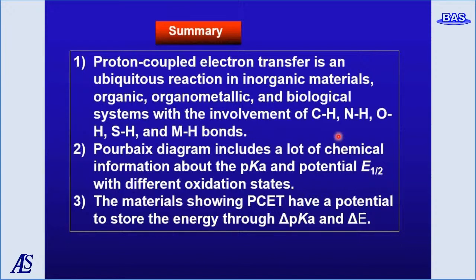Second, the Pourbaix diagram includes a lot of chemical information about the pKa and potential E½ with different oxidation states of the materials. The materials shown here have potential to store energy through pK difference and potential difference.